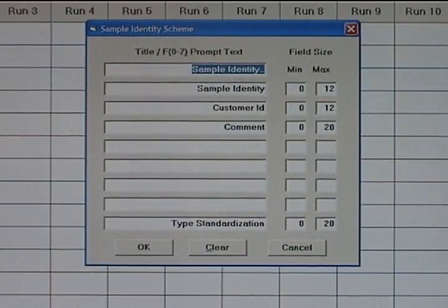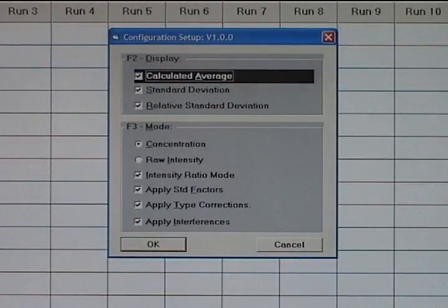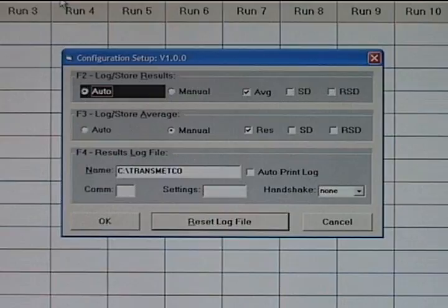Sample ID fields can be custom configured for individual requirements and to make recall of data at a later time more efficient. Various other settings are available to allow you to customize the system mode of operation to your liking, including the ability to automatically store data to a local or remote file if you have a network. Results can be stored to a CSV file format that can be easily read or imported by various other software applications as well.